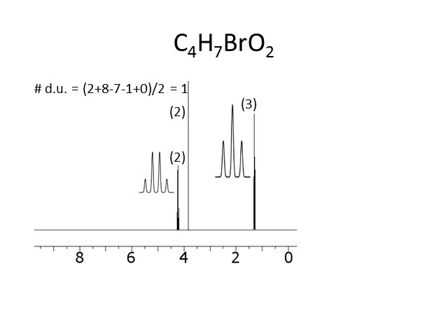I've just got this proton NMR. So let's look at the proton NMR. I see 3 signals here. They all seem to be hydrogens on sp3 hybridized carbons, right? Hydrogens on sp3 hybridized carbons come between 0 and 4-ish. But of those, two of those signals, this signal and this signal, are more to the left.